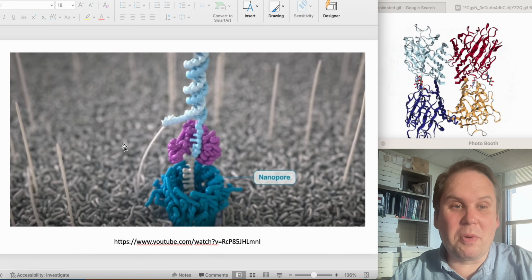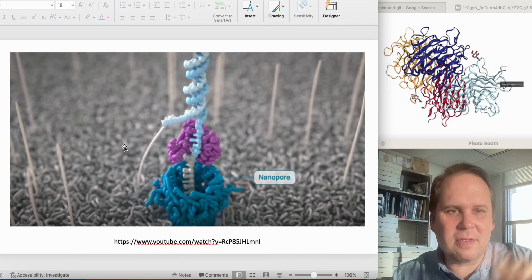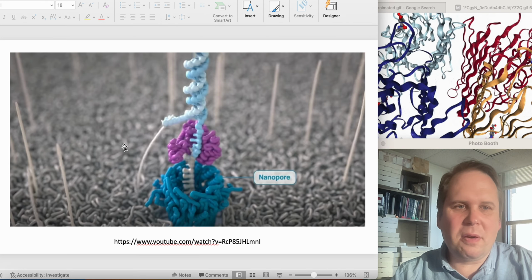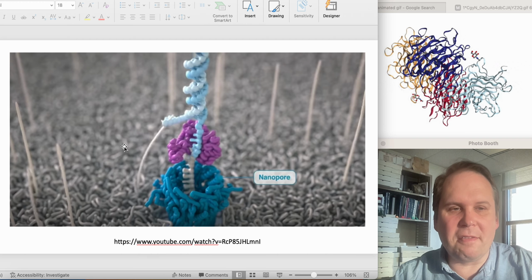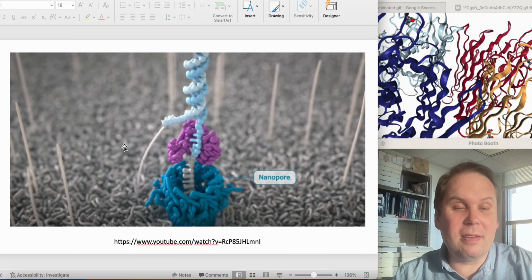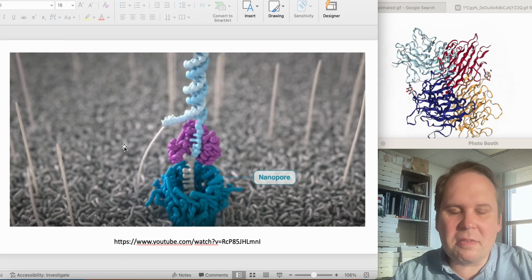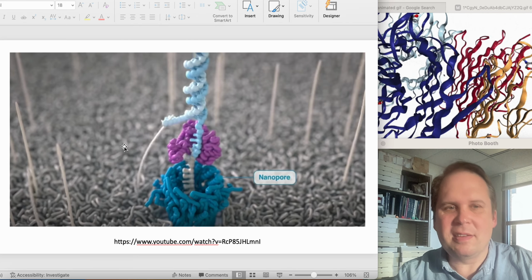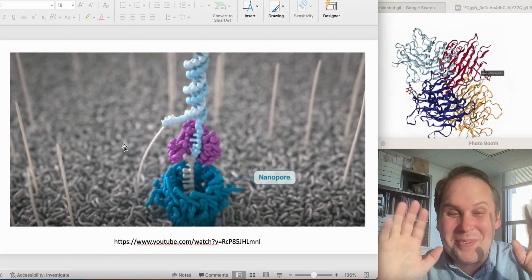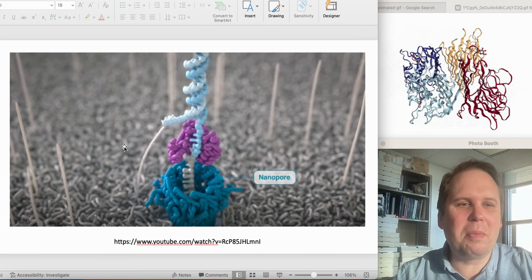And so, with nanopore, each pore can read out one DNA sequence, and then another, and then another, and there'll be a little gap in between them. And so you can generate lots and lots of very long reads, because the pore can slurp an unlimited size piece of DNA through. And so it can read you 30,000 bases all at one time, whereas we were getting like 50 to 250 with pyrosequencing. We were getting up to 1,000 with Sanger sequencing. But tens of thousands, no big deal.